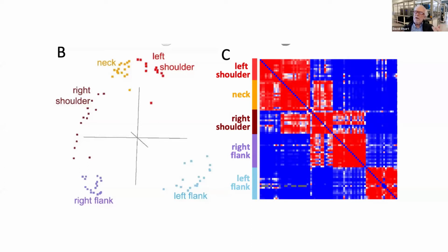So what we did was Helen made a mesh around the receptor binding domain. We took, I think, 4 antibodies of known structure, some that we determined and some other people had determined, and added those to the competition mix to give us anchor points.